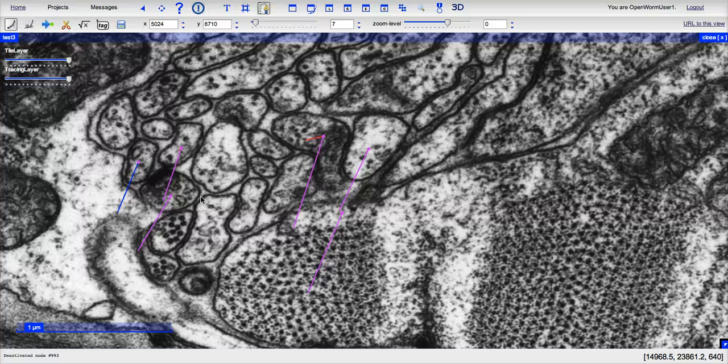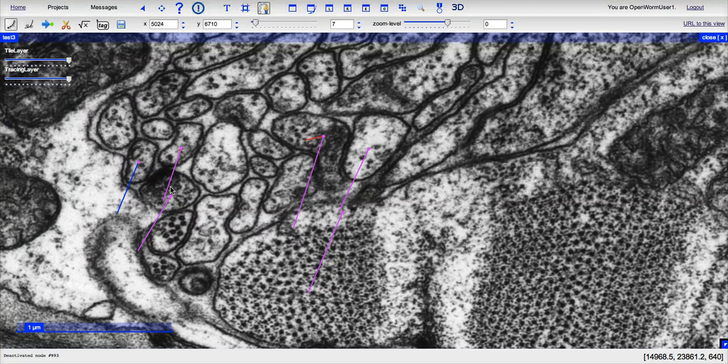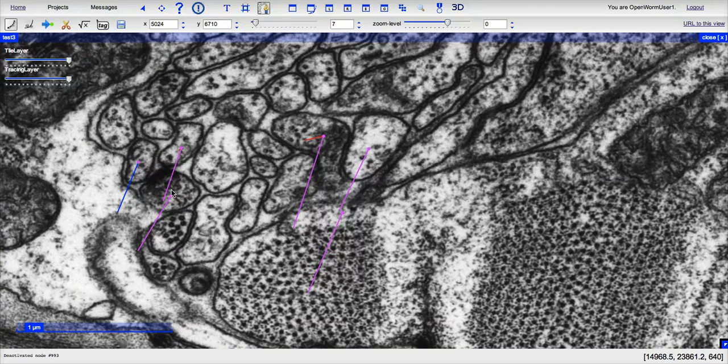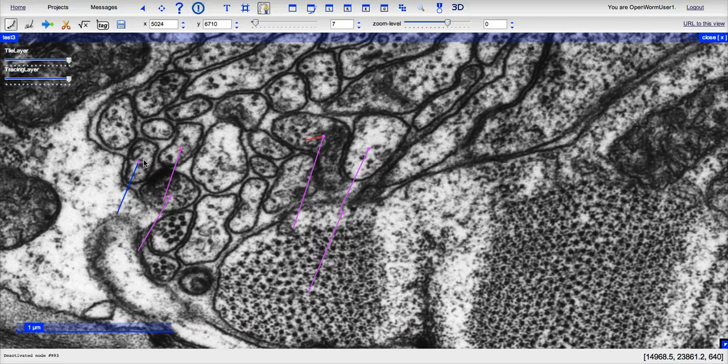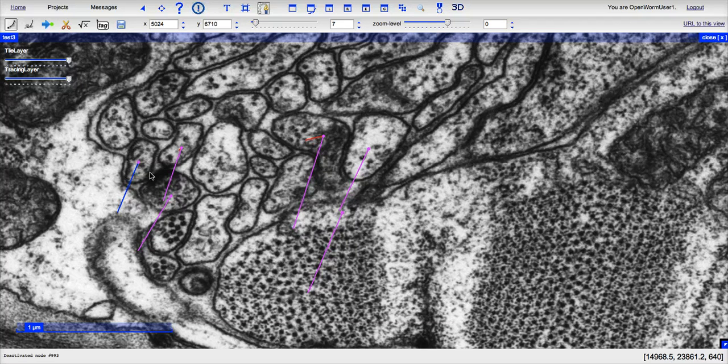In this, you can see that this neuron here is synapsing onto what I would say these two cells, this one with the blue and this one with the pink.